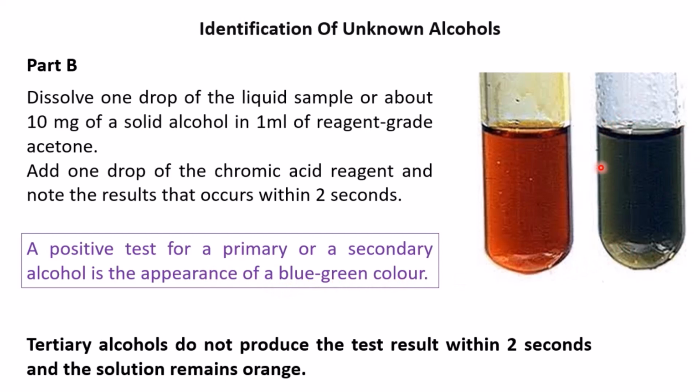The chromic acid reagent is orange-like, so after adding this reagent to your unknown, the positive test result is this blue-green color.